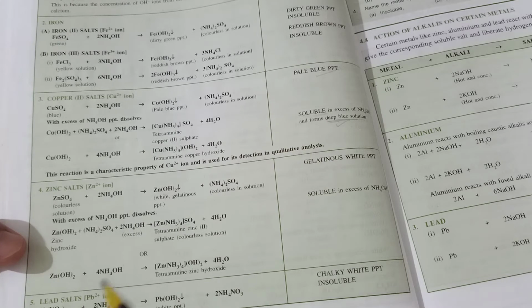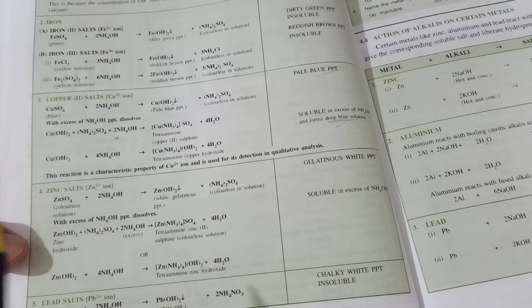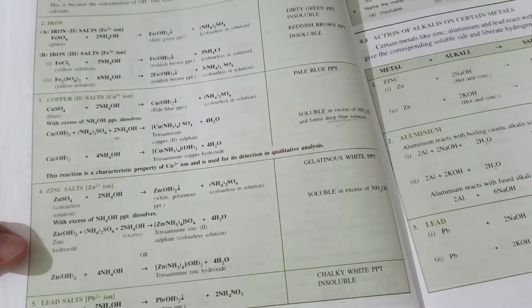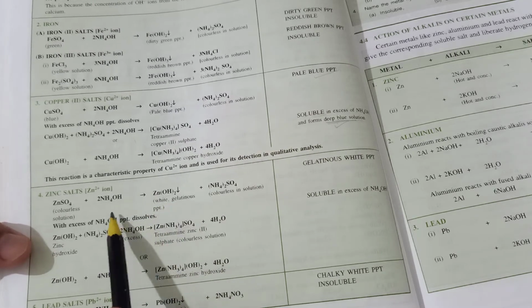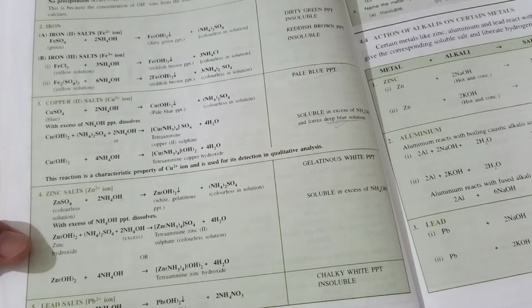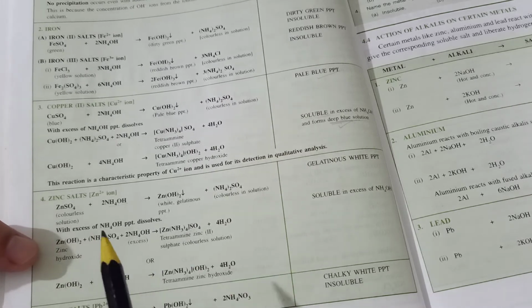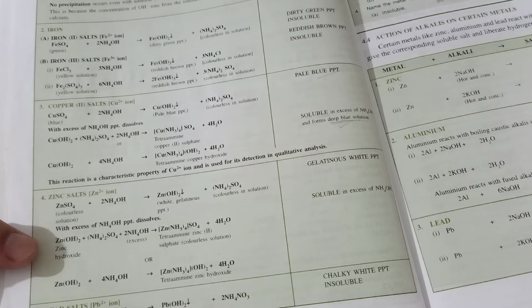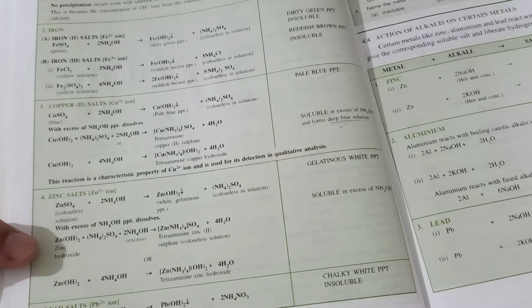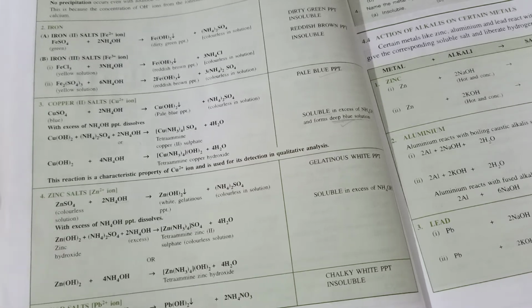That means the zinc hydroxide white gelatinous precipitate formed by sodium hydroxide also dissolves in excess sodium hydroxide, and the zinc hydroxide white gelatinous precipitate formed by ammonium hydroxide also dissolves in excess ammonium hydroxide. So in both cases of alkalis, the metallic hydroxide gets dissolved. That means the hydroxide is soluble in both of these alkalis.